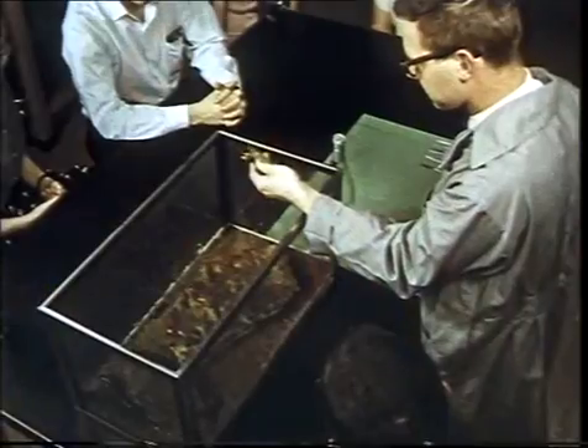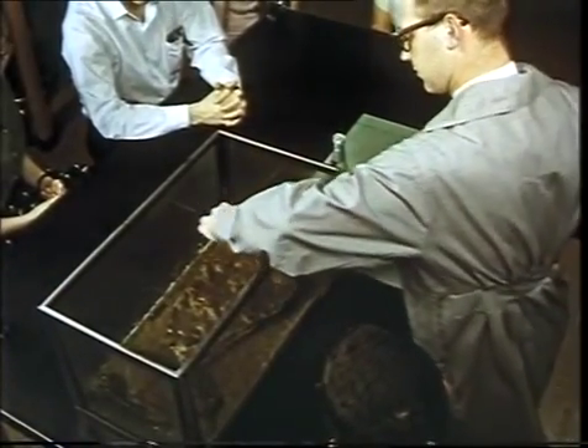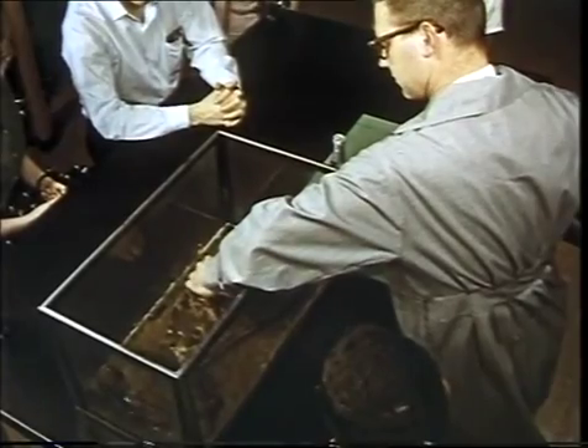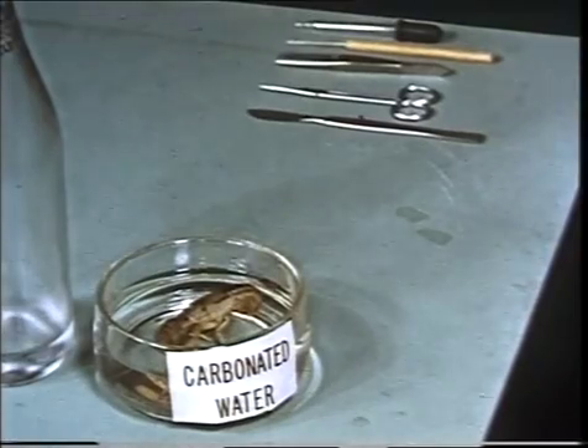Next, the internal organs of the crayfish are examined. In order to retain the natural form and colour of its organs, a freshly anaesthetised specimen is used. One method of anaesthetising a crayfish is to place it in carbonated water.